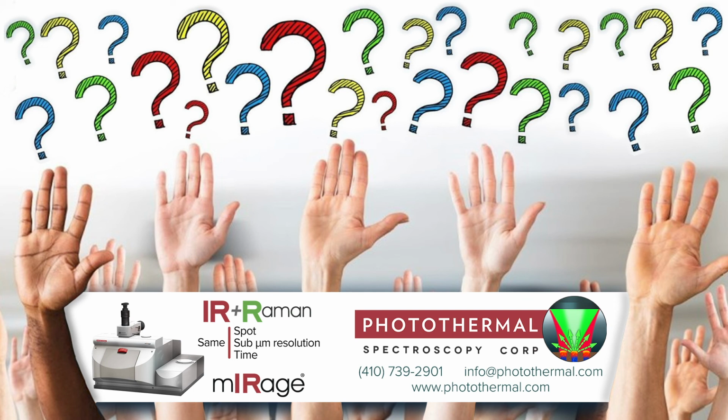This is a very good question, and it shows that it could be more complex. Yes, indeed, IR and X-ray penetrate the sample, and it could be that we have spectral co-localization, but the studied materials could be separated in the cells and not co-localize.